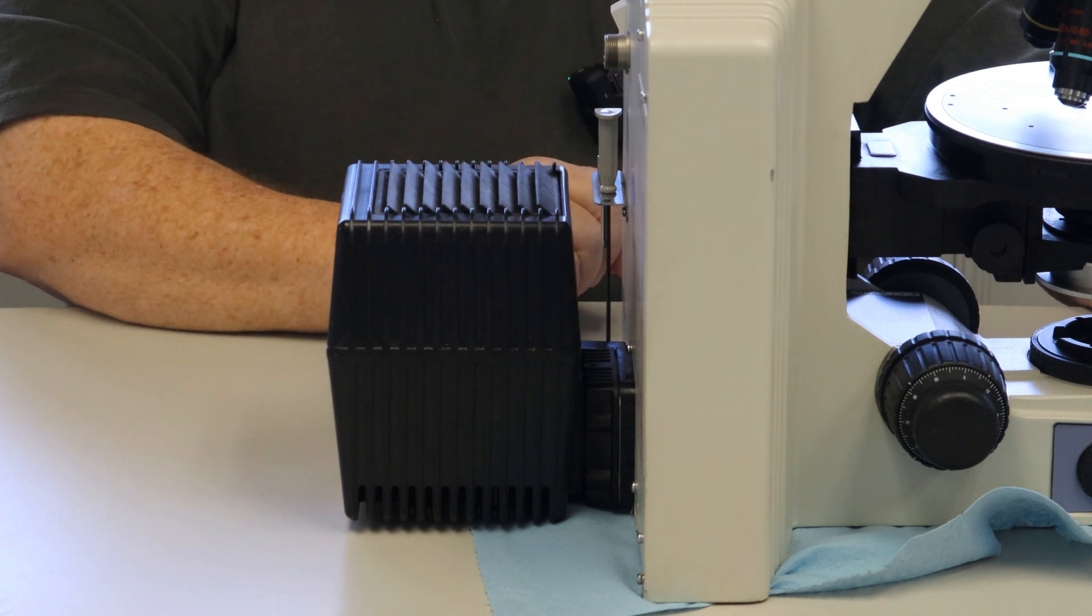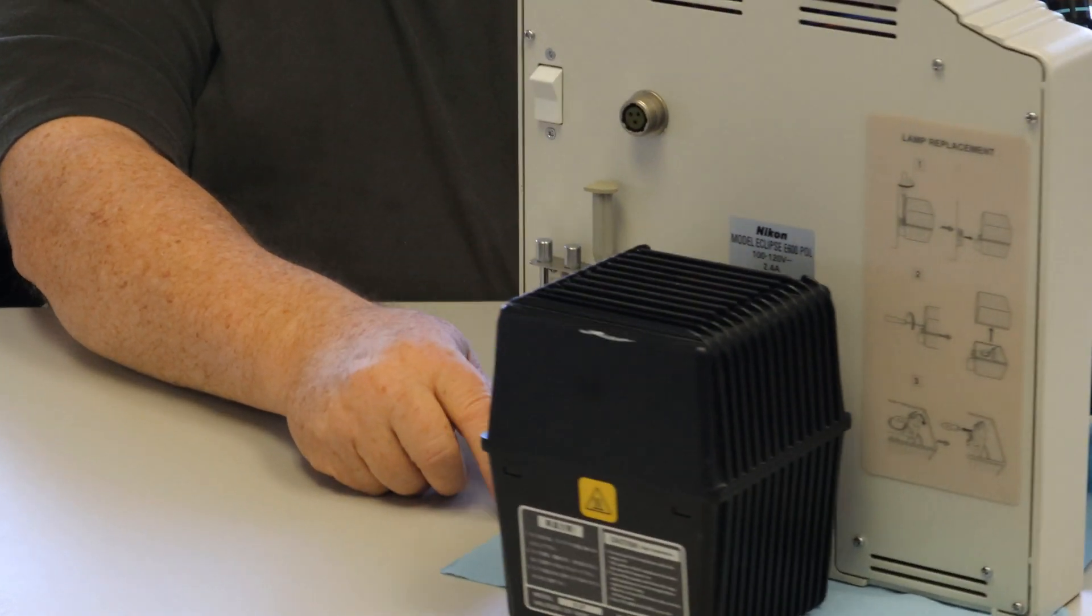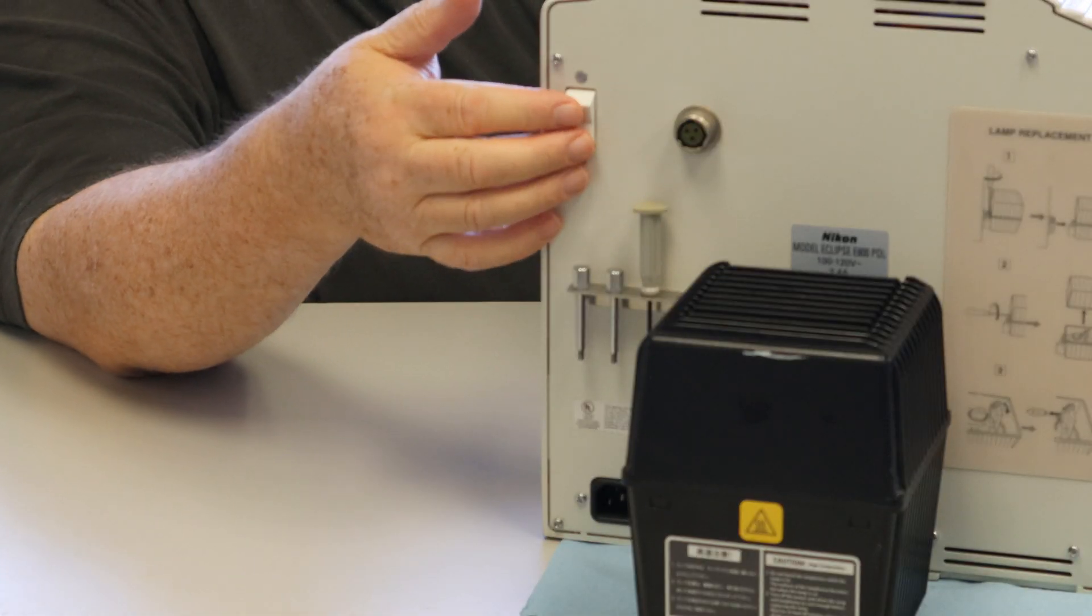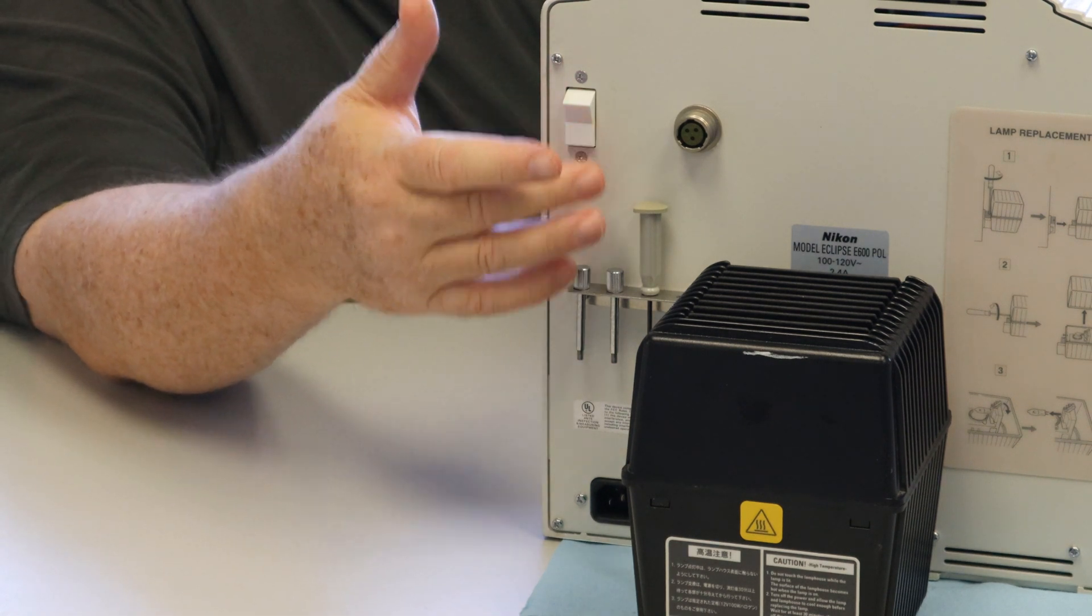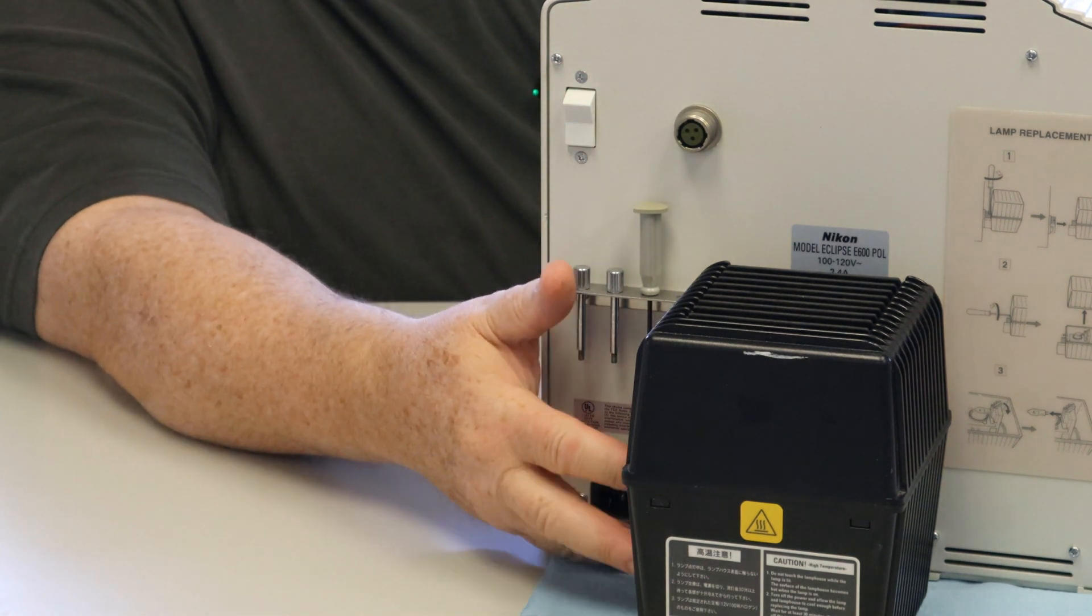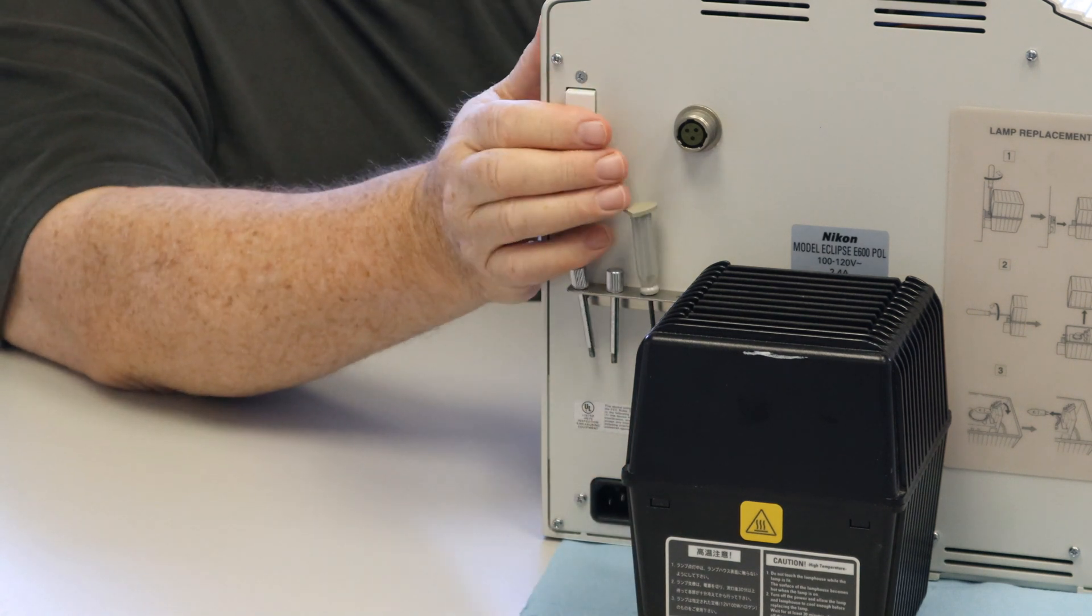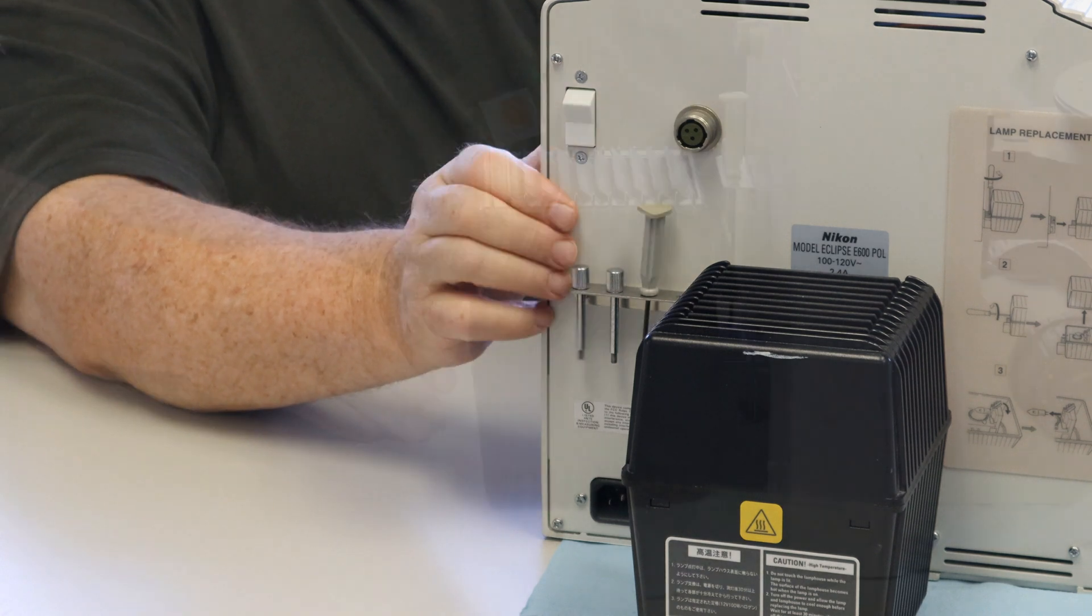If you're trying to diagnose a problem with your microscope, you have a dual lamp source or power source. DIA for your bottom light, or EPI for your top. But today we're just going to concentrate on the DIA.